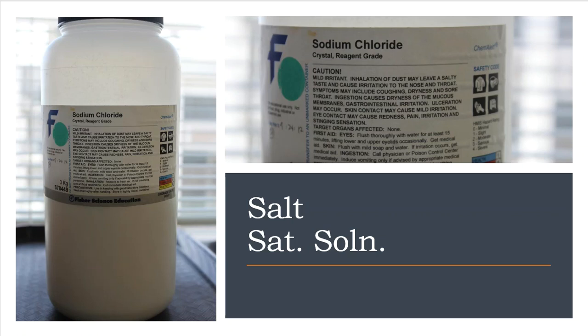Next is a salt solution. So here in this slide, you're seeing our jar of sodium chloride to the left. If I zoom in on the label, you're going to see that it comes from Fisher Scientific over on the right-hand side. And I need to make what we call a saturated solution. Folks, this is the easiest type of solution to make in a laboratory. How do you make saturated solutions? You just add the solid, then add some water or some solvent to it, and you give it a stir.